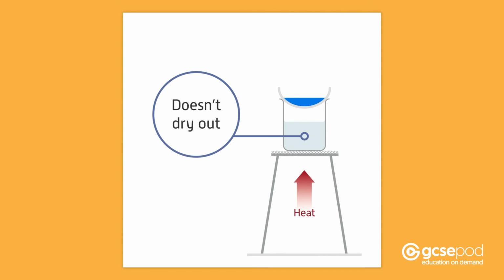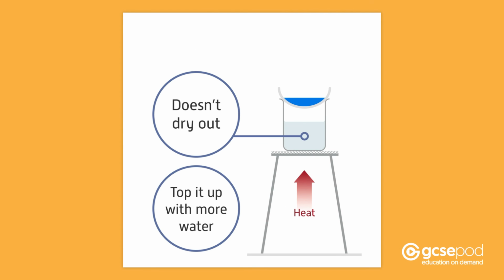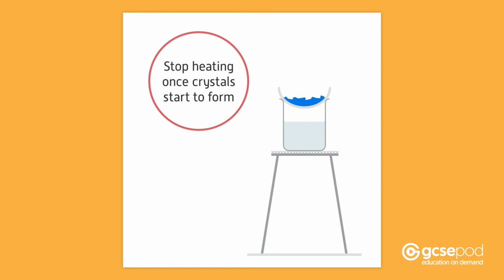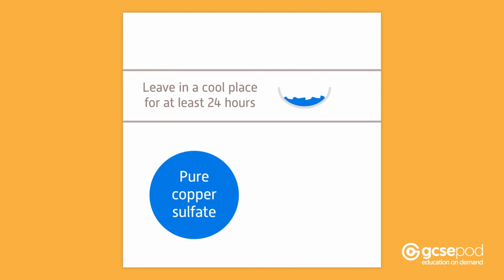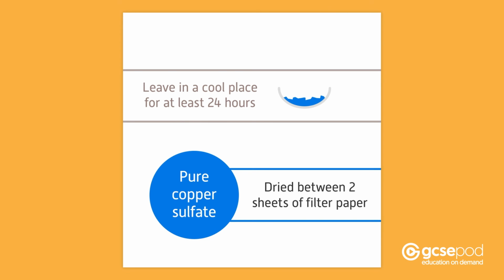Make sure that the water bath does not dry out. You might need to top it up with more water. Stop heating once crystals start to form in the basin. To complete the evaporation process, leave the evaporating basin in a cool place for at least 24 hours. The crystals formed are pure copper sulfate and can be carefully dried in between 2 sheets of filter paper.